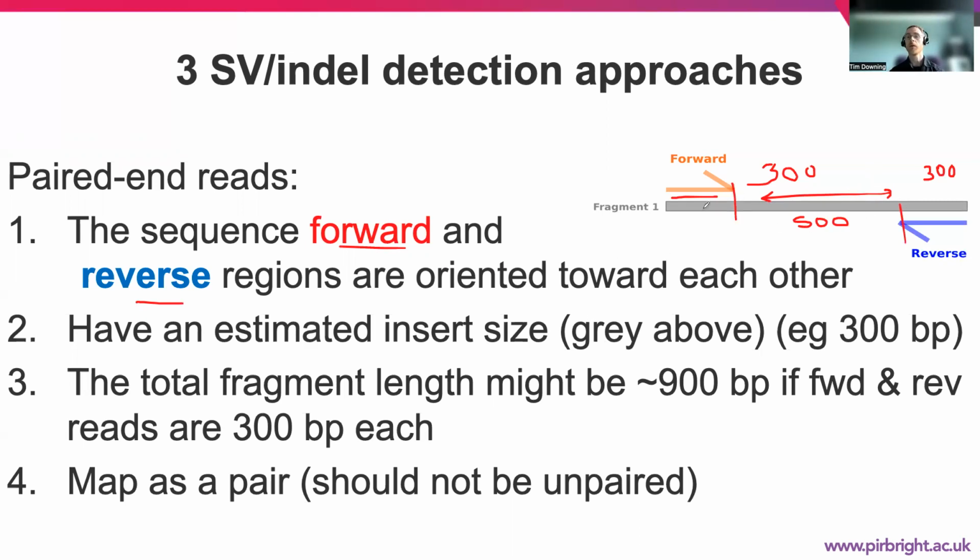What is worth remembering then is when we try to map these reads to the reference genomes or contigs that we're looking at, the forward and reverse reads will be known, whereas the insert size in the middle will not be known. And we have particular information about the forward and reverse reads, including things like the read orientation. So the orientation, is it looking forward and reverse as it is there? That's the read length itself, the length that's mapped.